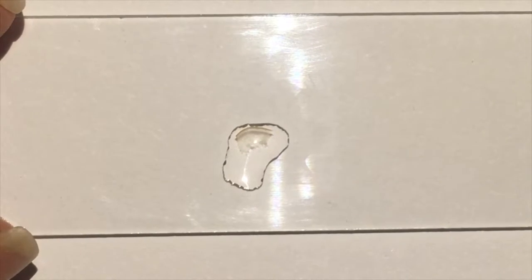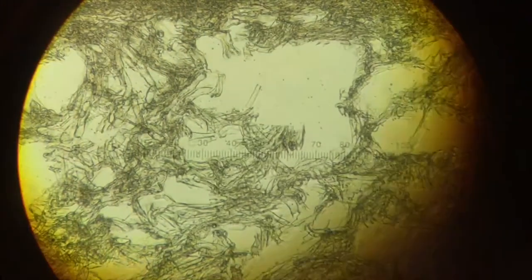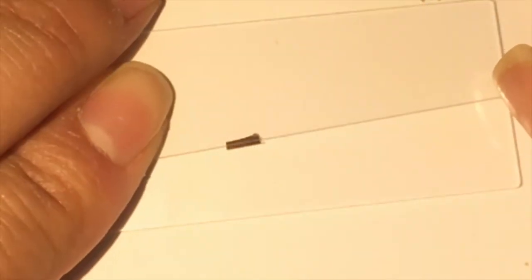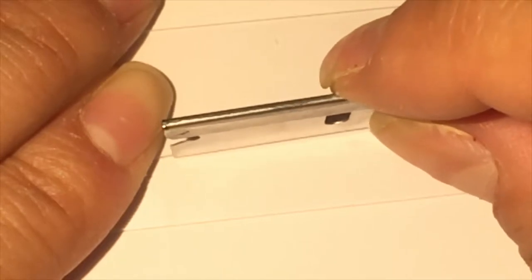So now I think we're ready for the cover slip. Not a very big fan of this section. The context is good. You can see the hyphae. So this time I'm going to try and cut it without looking through the phone screen and just use my eyes.